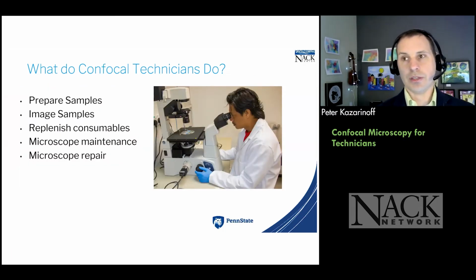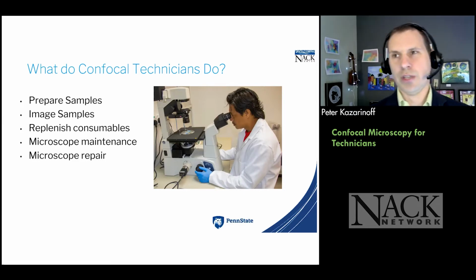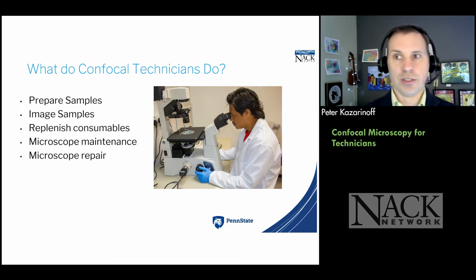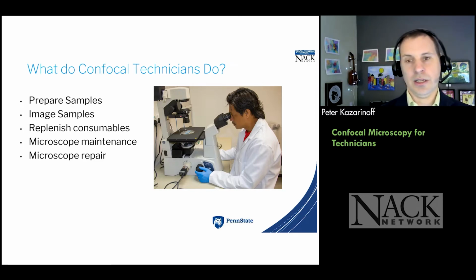So that was the reason that we wanted to use laser scanning microscopy in our training, even though it isn't really a nanotechnology characterization method, because you are limited to the diffraction of light rather than using electrons to image the sample in the case of SEMs and TEMs.